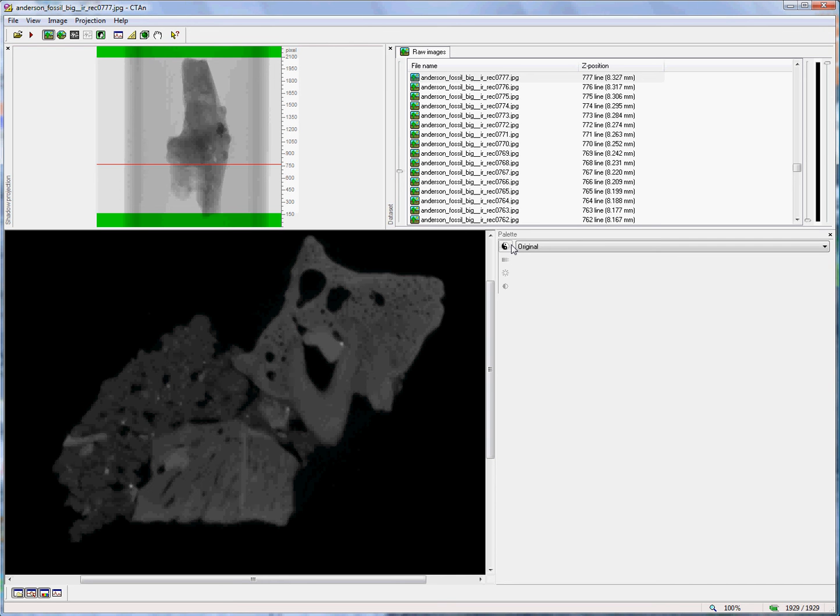Hello. Skyscan CT Analyzer version 1.10 and above has a new function for real-time viewing of 3D volume-rendered models. These are different from the surface-rendered models that you will see in the Skyscan CT volume program.